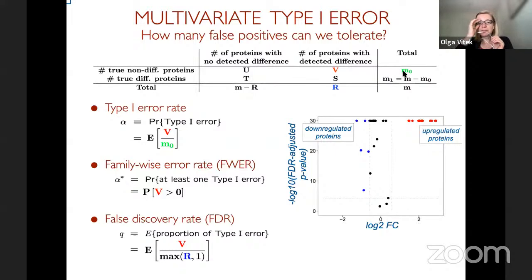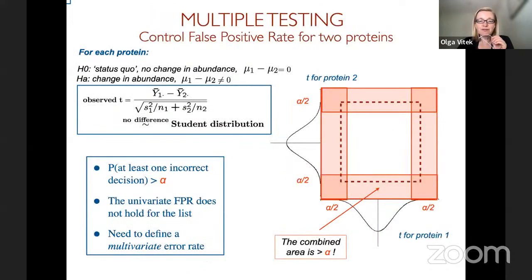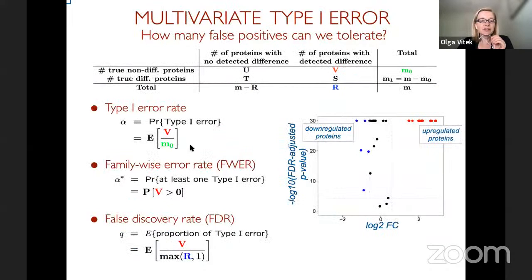However, there are statistical procedures which allow us to control the average proportion of false positives in the list of proteins which we claim are changing. So it allows us to control V, the ratio of V divided by R. Well, we usually find at least something, so it's V over R. The previous approach, Bonferroni and others I mentioned, would really control that V is anything other than 0 with a very small probability.